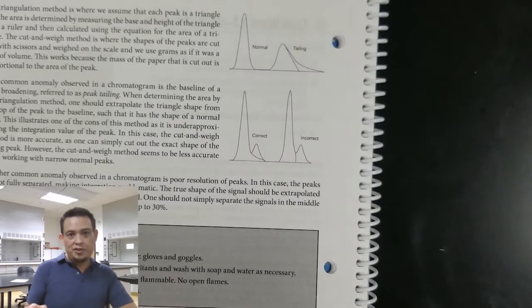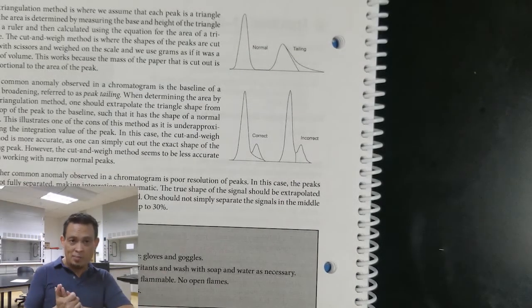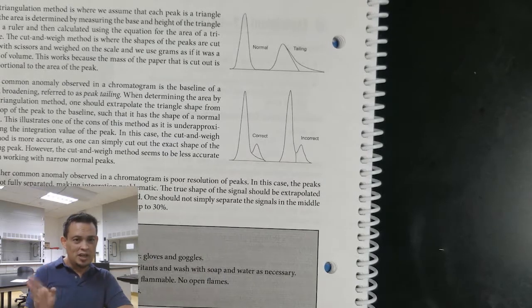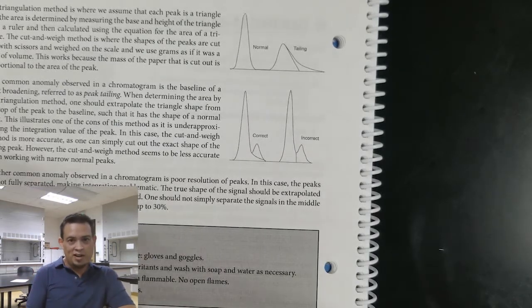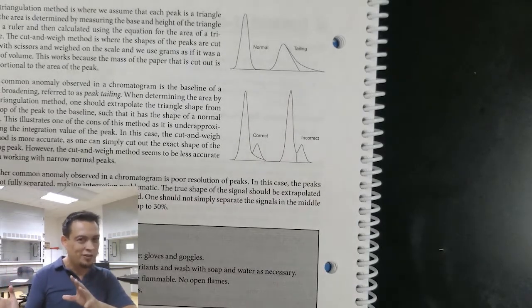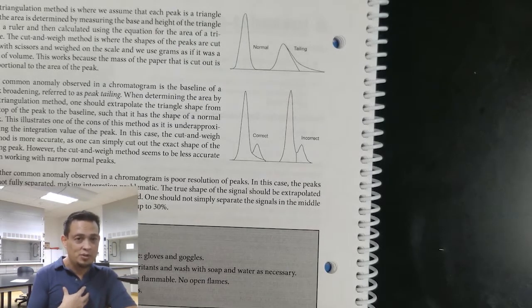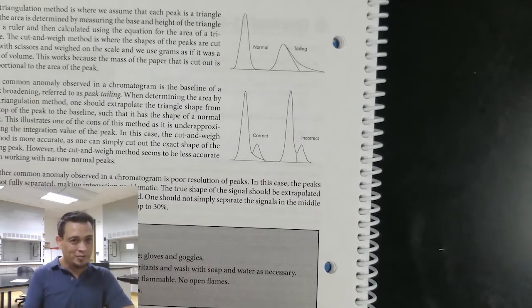So what we're going to be doing today is calculating percent composition by two different methods, and we're also going to take a look at a percent error calculation. Make sure that you communicate to your individual lab instructor what exactly they want for calculations for the GC, as all of us are a little bit different on what we ask for. So I'm just going to go over what I would normally ask my students to do, and then you ask your actual instructor if they want exactly what I said in the video here, or if they want something different.